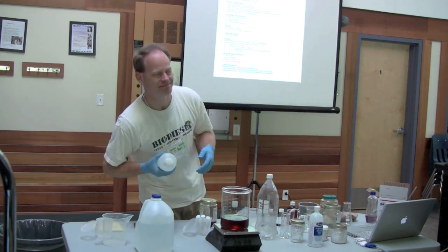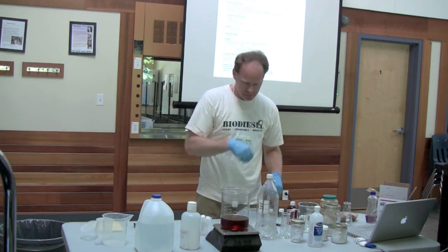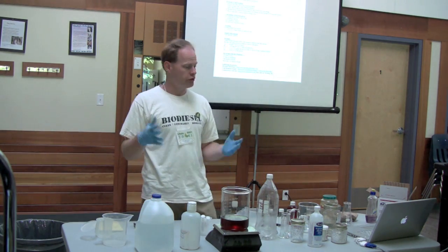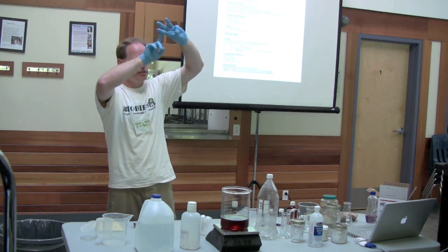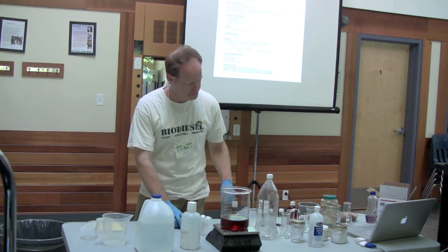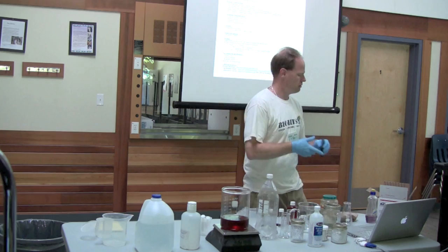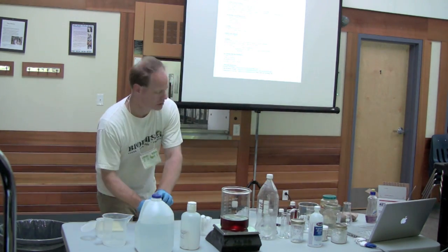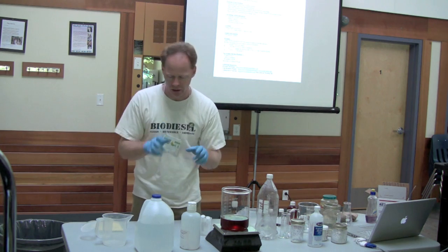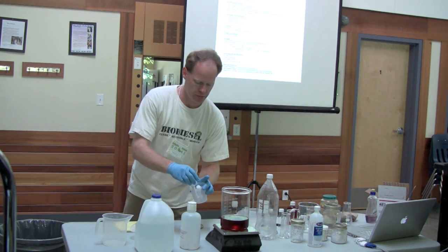Biodiesel's oil. Okay, so we're gonna mix that up. Our next step is we need to titrate this oil to figure out how much catalyst we're gonna use. Remember, we gotta count how many of these fatty acids are going on. So with this out of the way, we're gonna titrate. Again, all the instructions to do this are available if you email me, or on the website, you can actually watch a YouTube video of me doing this as well.